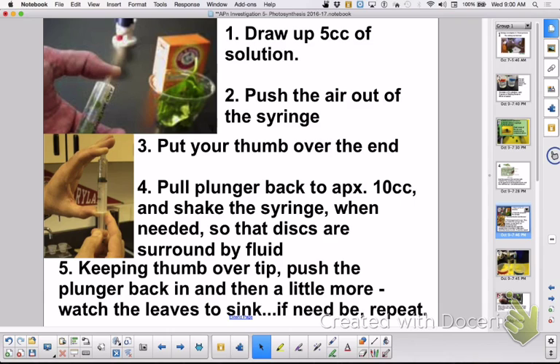What do I do? I put the leaves in here, right? Okay. I make sure this water has my baking soda in it and my what? Soap. Okay, good. And then what do I do? Put the leaves in and then what? Smash. Okay, do I smash? No. Okay, yeah. And remember you're doing 2 of these at a time, right?